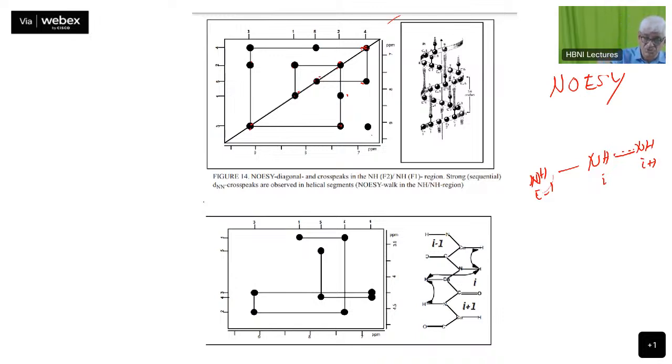Half of the correlations are shown on the top and some others are shown on the bottom. So you will see correlations along the chain like that. Okay, you go from one residue to whichever one is the next, neighboring residue, you will see those. Why do we see those neighboring residues? We will see soon. That depends upon the distances which are there. Therefore, this requires distance information.